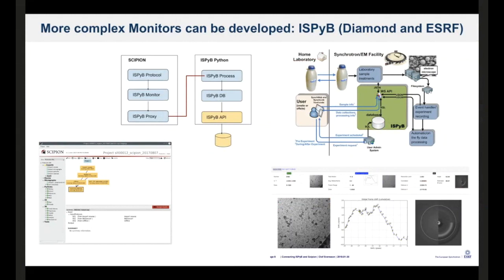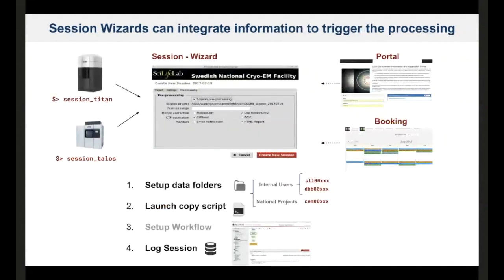Something that is different in this approach in Scipion is that we modify the underlying infrastructure just to allow computing on the fly, but then it's the same framework. So here in the Swedish facility, we usually provide this on-the-fly data processing every day, and then the users get, together with the raw data, all the project, and then they can just review what was done or continue from this point, or reproduce and repeat some of the steps with different parameters. It means that it's not a script-based approach, where it's difficult to extend in the future with new algorithms or provide reproducibility for the users.